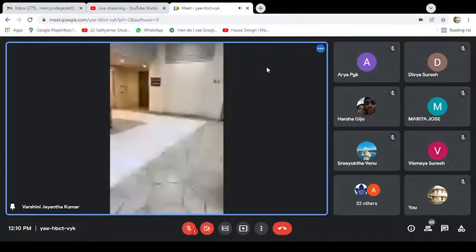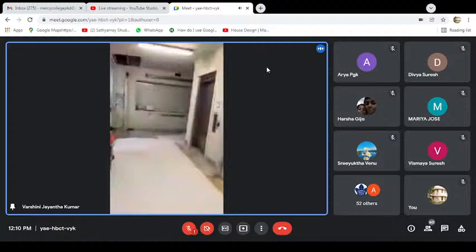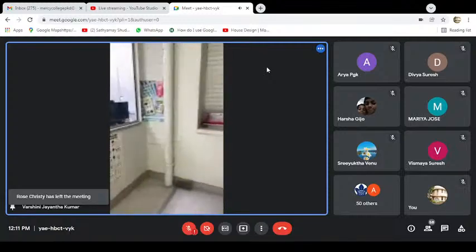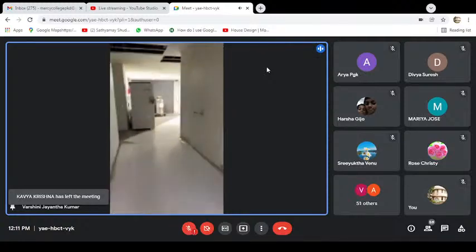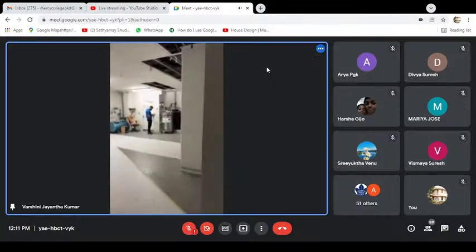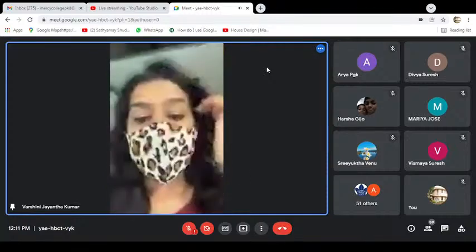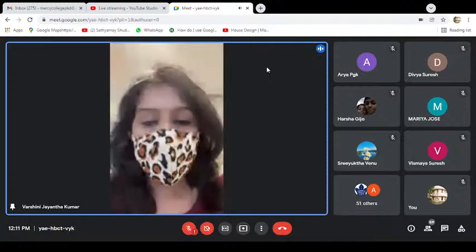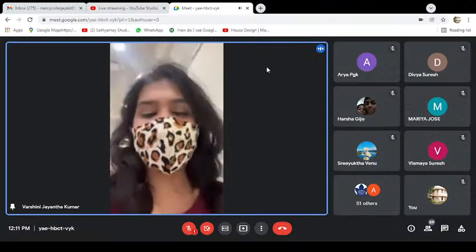And then, okay, right here, it's currently closed. Again, unfortunate. But this is our chem store where we come for shopping of chemicals. We have Louis who helps us with giving us the right amount of chemicals and the solvents, and then we have liquid nitrogen right there. Sometimes we need reaction conditions at really low temperature, so we feed it with liquid nitrogen so that the temperature goes down to minus 100 degrees Celsius, and then we can run our reactions.